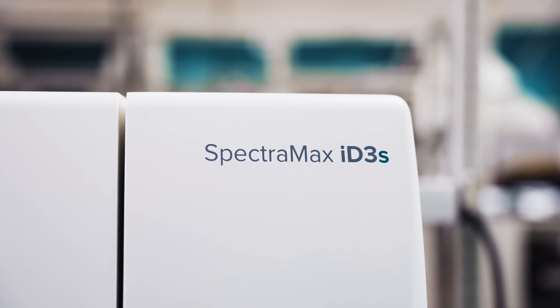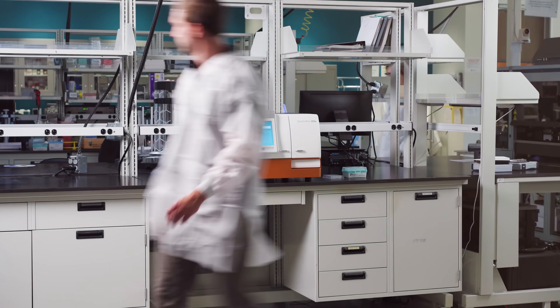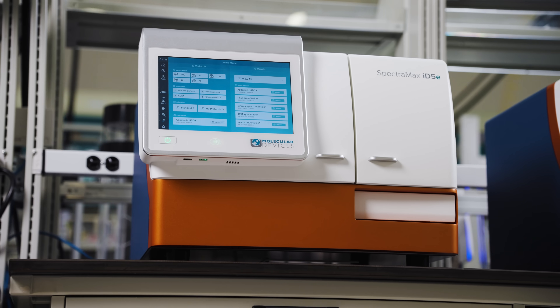From the streamlined ID3S to the enhanced ID5E, there's a SpectraMax ID reader built to meet the needs for any laboratorian. Explore the right solution for your next transformational breakthrough.